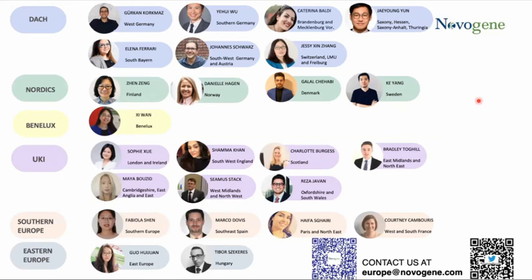But for some samples, such as FFPE samples, where you fix your samples in paraffin and store them for years, those RNAs may degrade heavily. So for those messenger RNAs, it's very hard for us to use poly-A to enrich them. So in that case, we will use the ribosome removal library preparation.